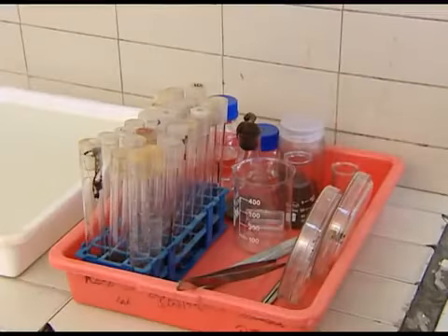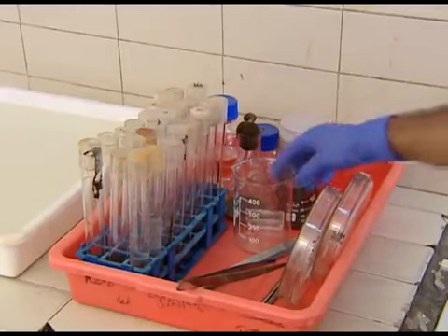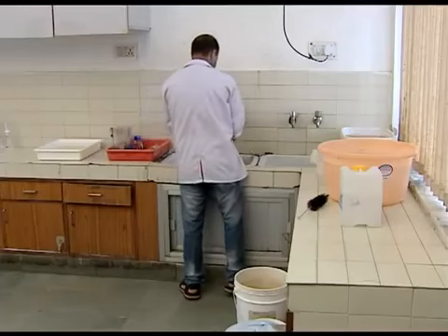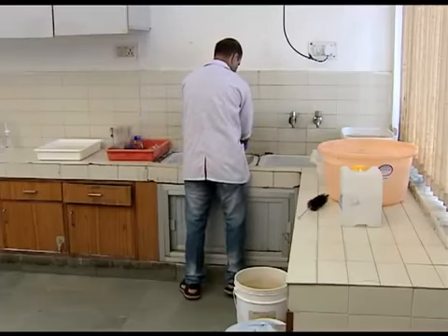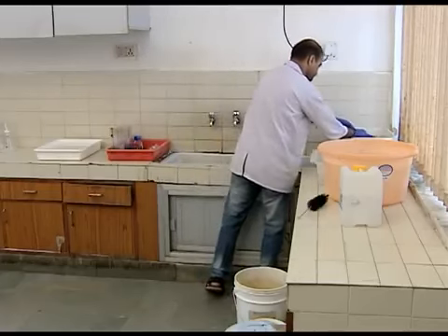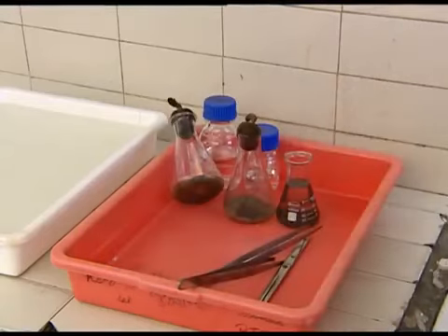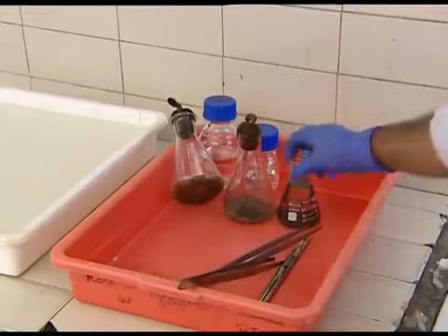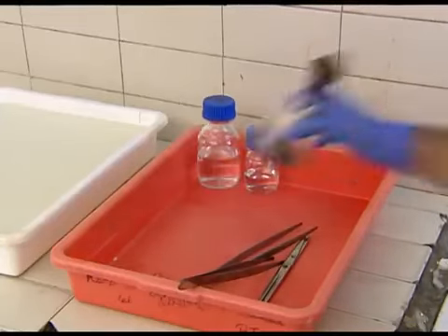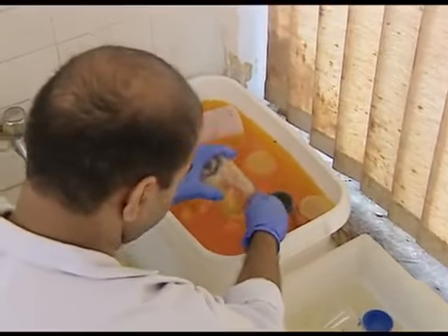Before performing a plant tissue culture experiment, it is required to have clean and sterile culture vessels. Before using any glassware or plasticwares, these are first washed in a 4-step process. Firstly, all used glass and plasticwares with used cultures and media are autoclaved for about 1 hour. Then the glass and plasticwares are immersed in a tub full of chromic acid for 16 hours.